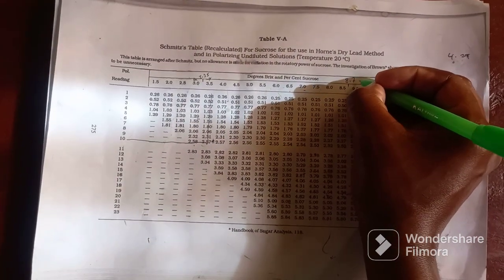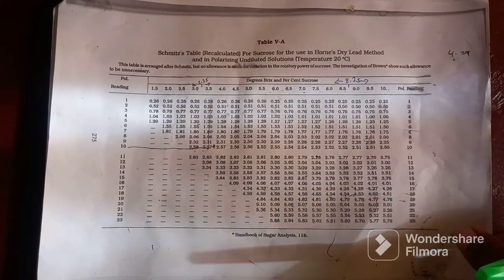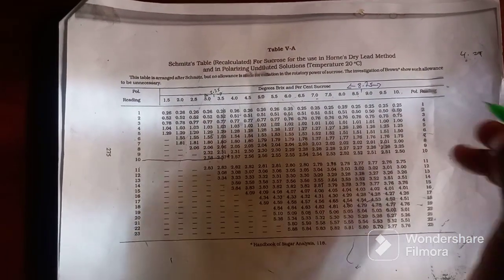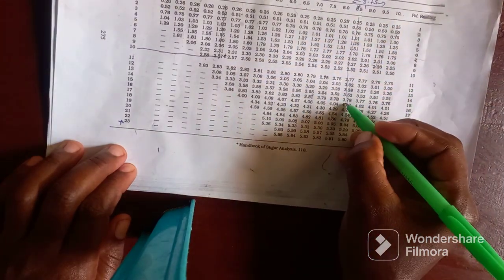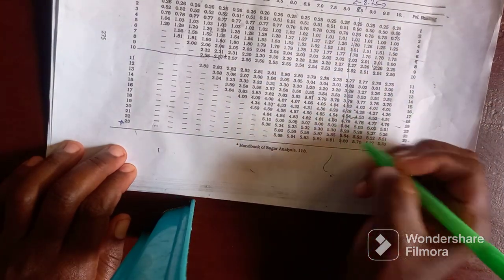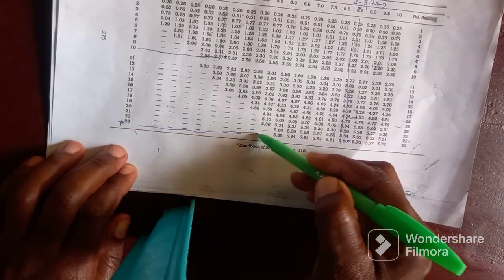So 8.6 lies below 8.75, so it's read at 8.5, and pol reading is 23.8. So we draw a line from 23, where the line of 8.5 and 23 meet is 5.80. So we record 5.80.